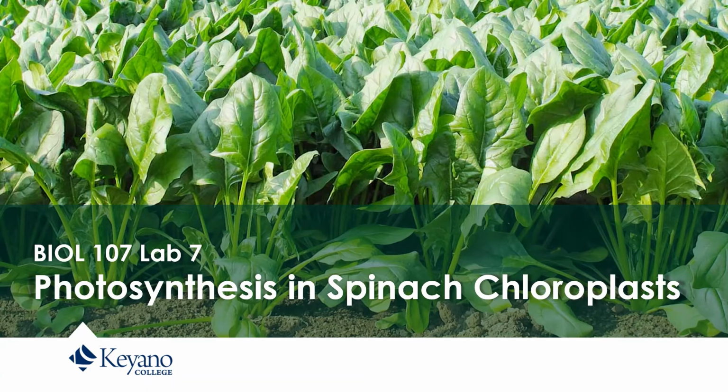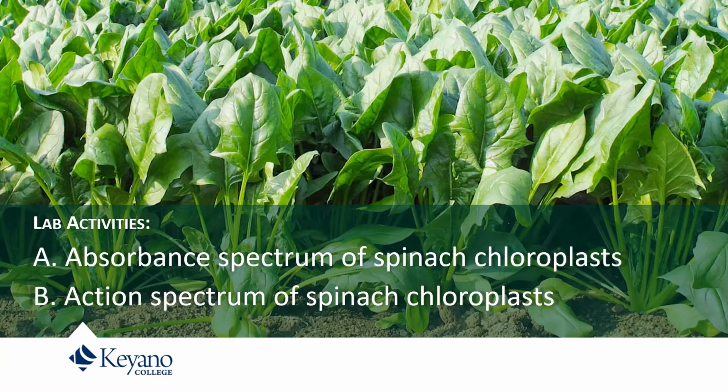Let's talk about Lab 7, Photosynthesis in Spinach Chloroplasts. Lab 7 has two parts. We're going to make an absorbance spectrum and an action spectrum. So let's talk about what those things mean.